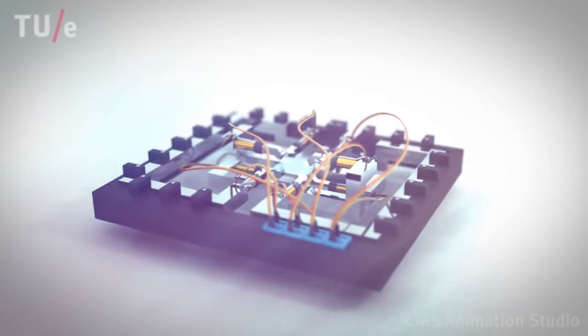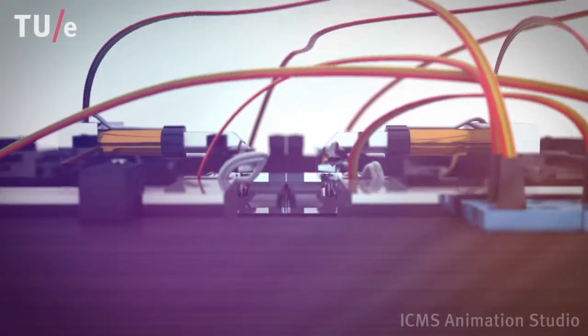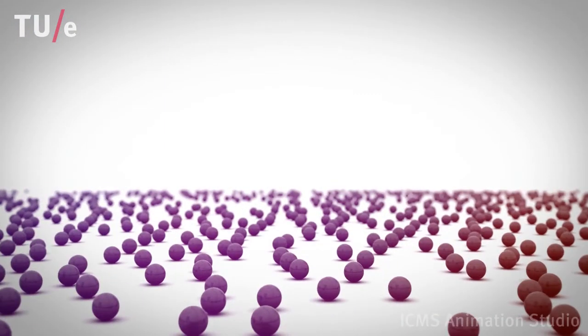We have built a special magnetic actuation setup with eight electromagnetic poles that can create three-dimensional time-dependent magnetic fields. In the center of the setup, we can place a microfluidic chip filled with a liquid suspension of magnetic microbeads.